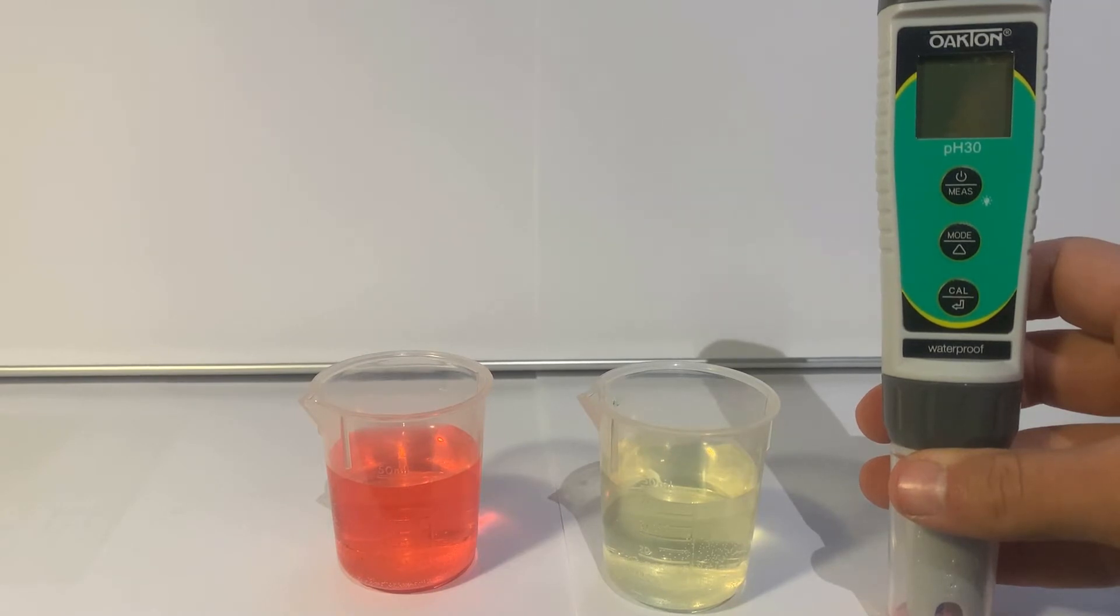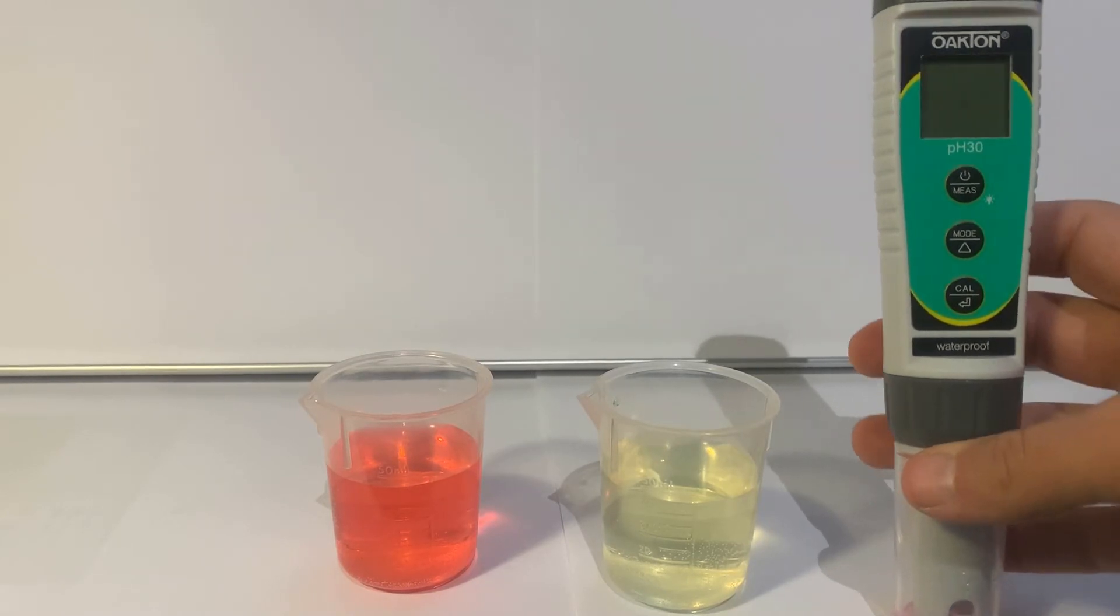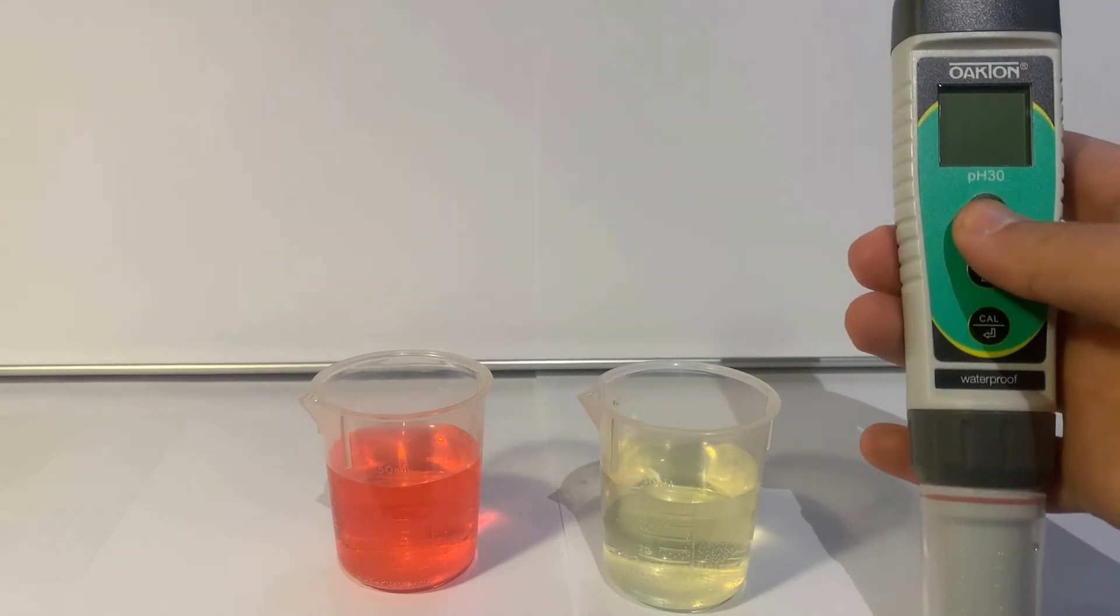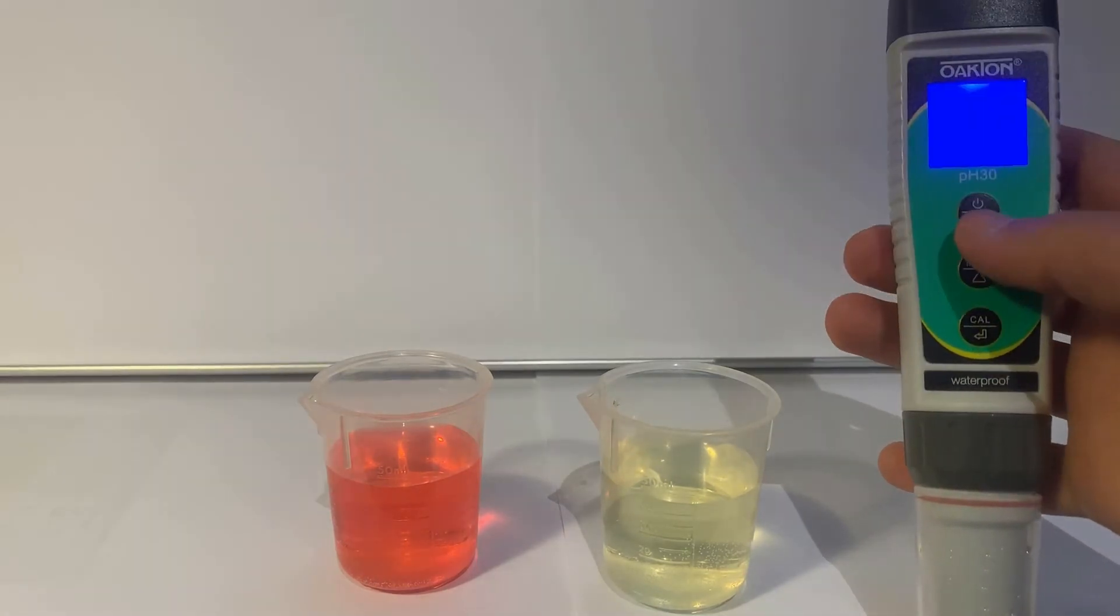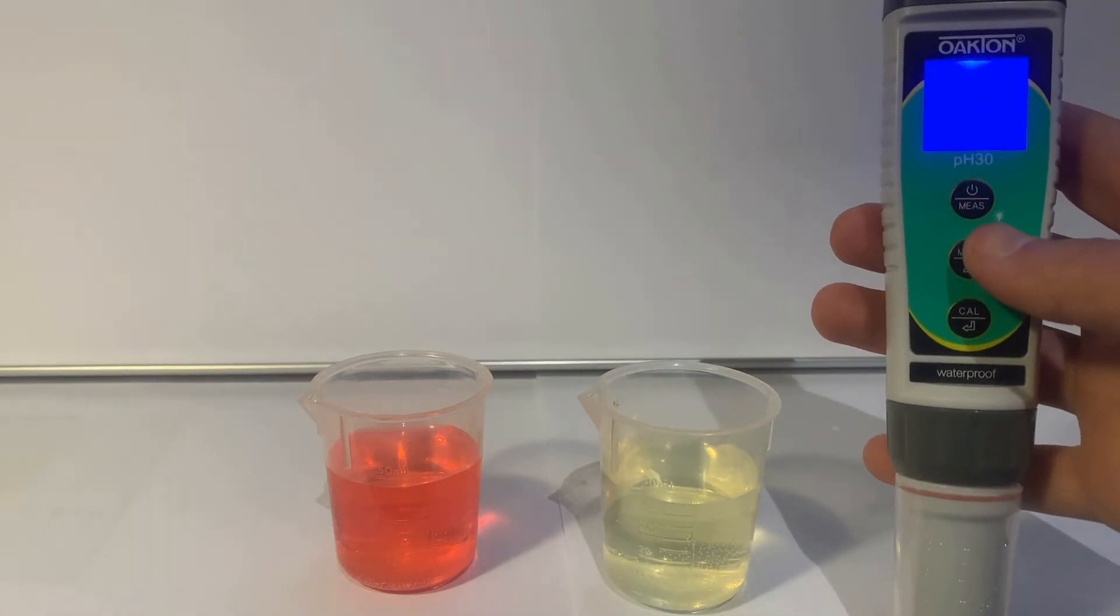Short press the power button to turn on your meter. You can short press this button again at any time to turn on the blue backlight on your screen if it helps you see.